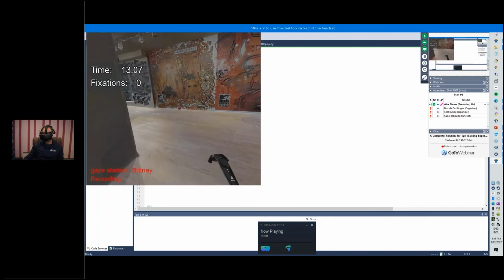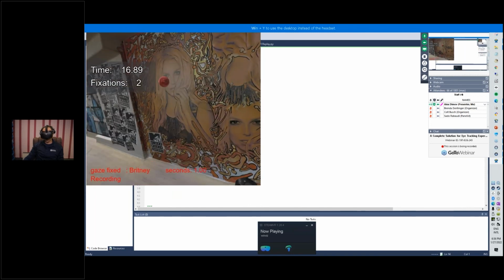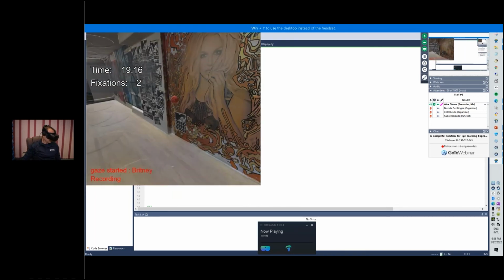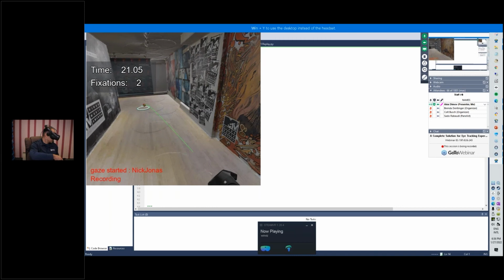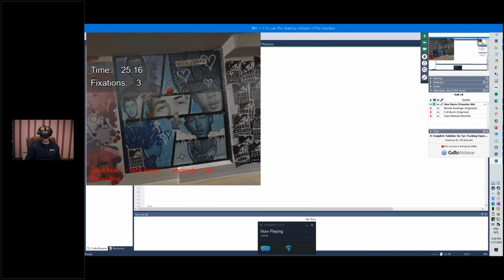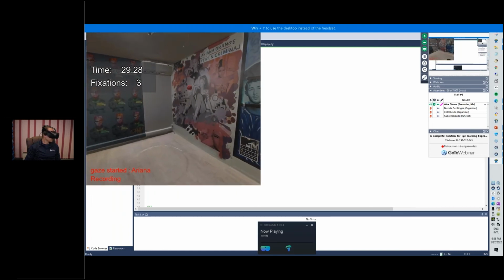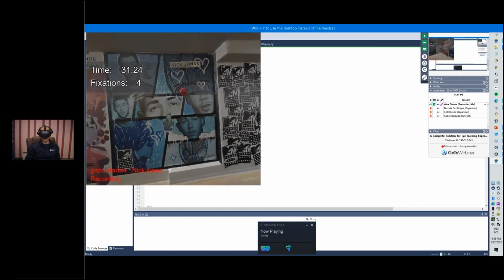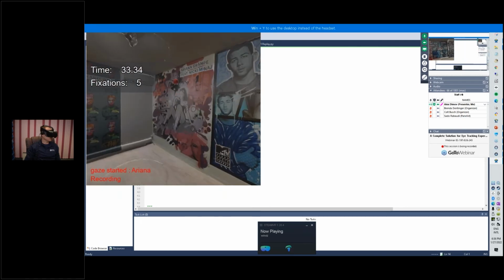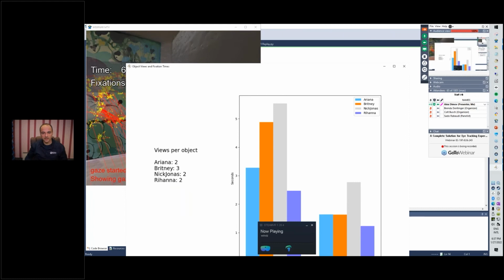I can navigate this world, just go to a different place, look at the artwork. So come over here, and I've set these up as tracking areas, so I can actually track them. Even though they're not 3D objects, let's stop here, and now let's have a look.